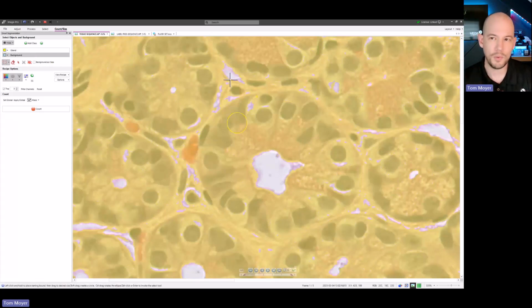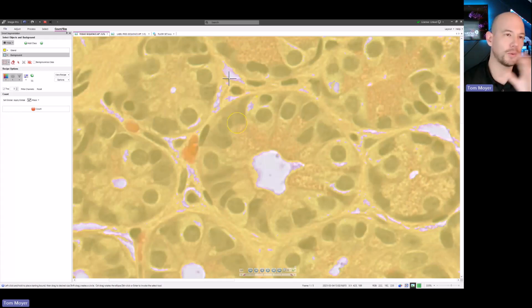Again, I don't want to dive too deep into this technique. Previously, for most customer applications, we would have to go through a filter library, add multiple different filters to an image, pre-processing techniques, just to increase contrast between the objects that we're looking to highlight and the background. This can take anywhere from several minutes to several days. I have spent up to 3-4 days, 8 hours a day trying to compile different pre-processing filters and techniques before trying to use machine learning to highlight objects.